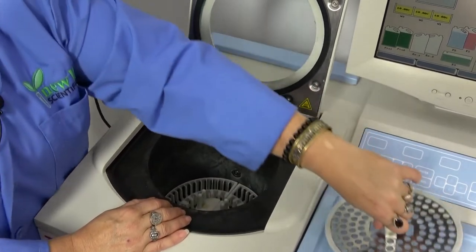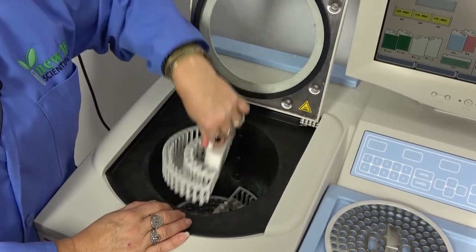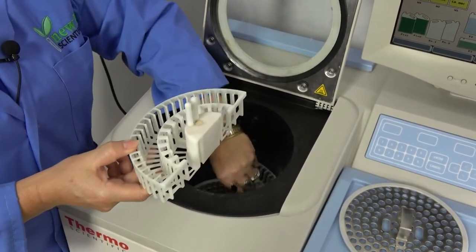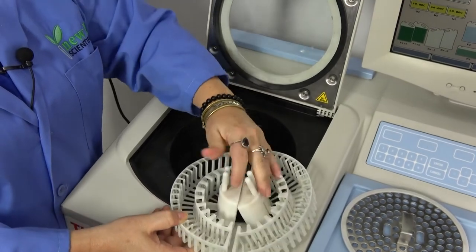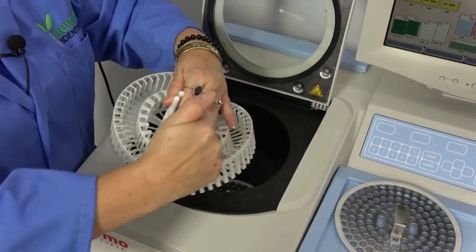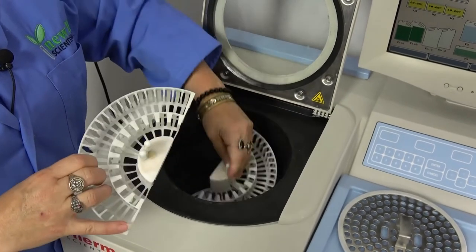Also in here is the unique basket system. Since it is round, these baskets lift out in halves. They stack up to three layers deep inside this chamber, and of course you fill it with all of your tissue cartridges there.